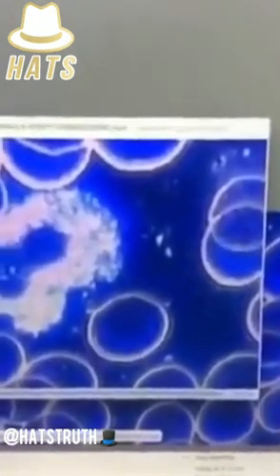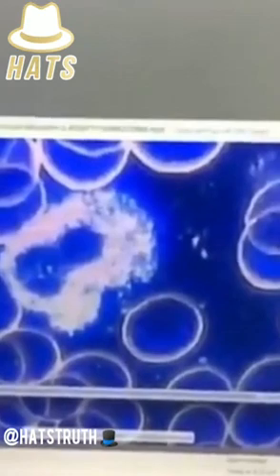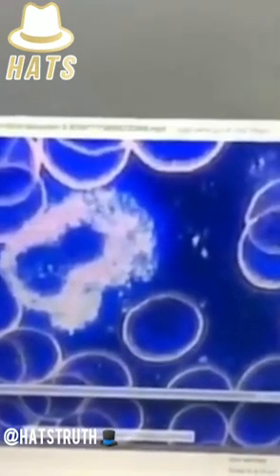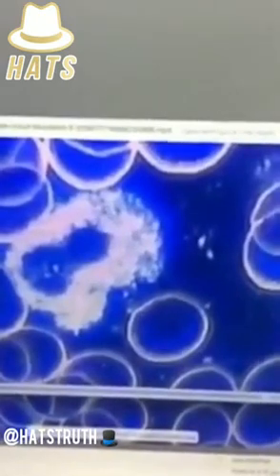I have never seen a white blood cell like this, so it was for me also like, wow, what's this? Why is this so aggressively working? You could say if an autoimmune activity or something goes on, the cells attacking something very strong. So it was not a normal white blood cell which we saw here.